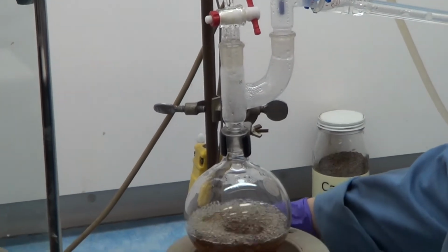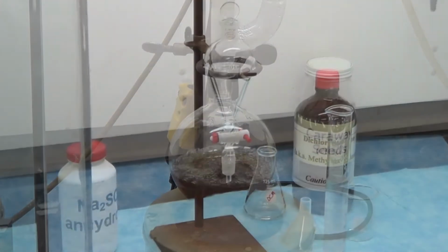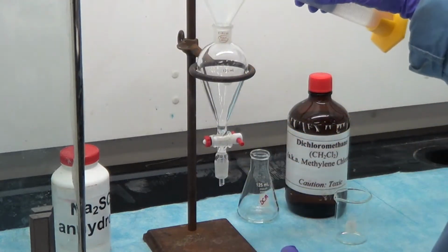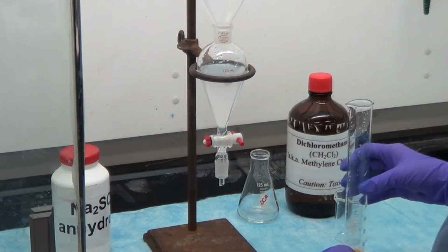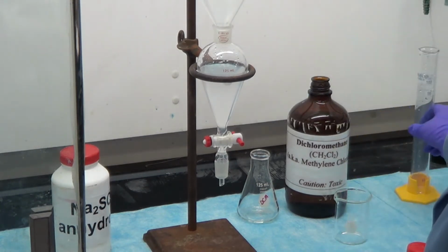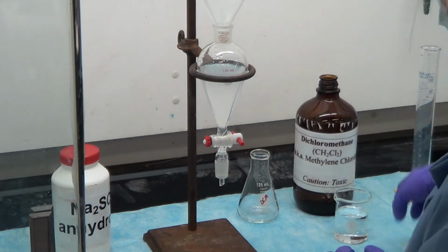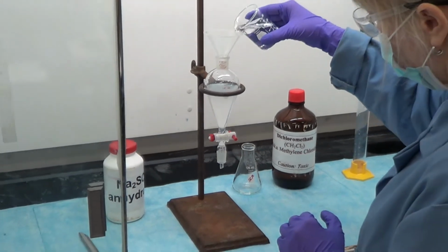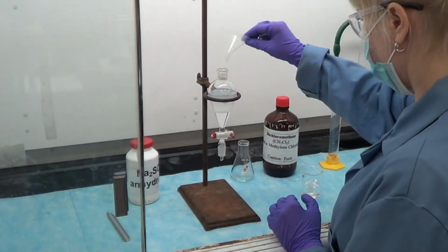Once enough distillate has been collected, the heat is removed from the round bottom flask and it is cooled. The seeds will then be discarded and cleaned up. The distillate is then transferred to a separatory funnel and extracted with dichloromethane, or DCM for short. DCM is added to the separatory funnel and the cap is put on. The separatory funnel is then shaken with intermittent venting.